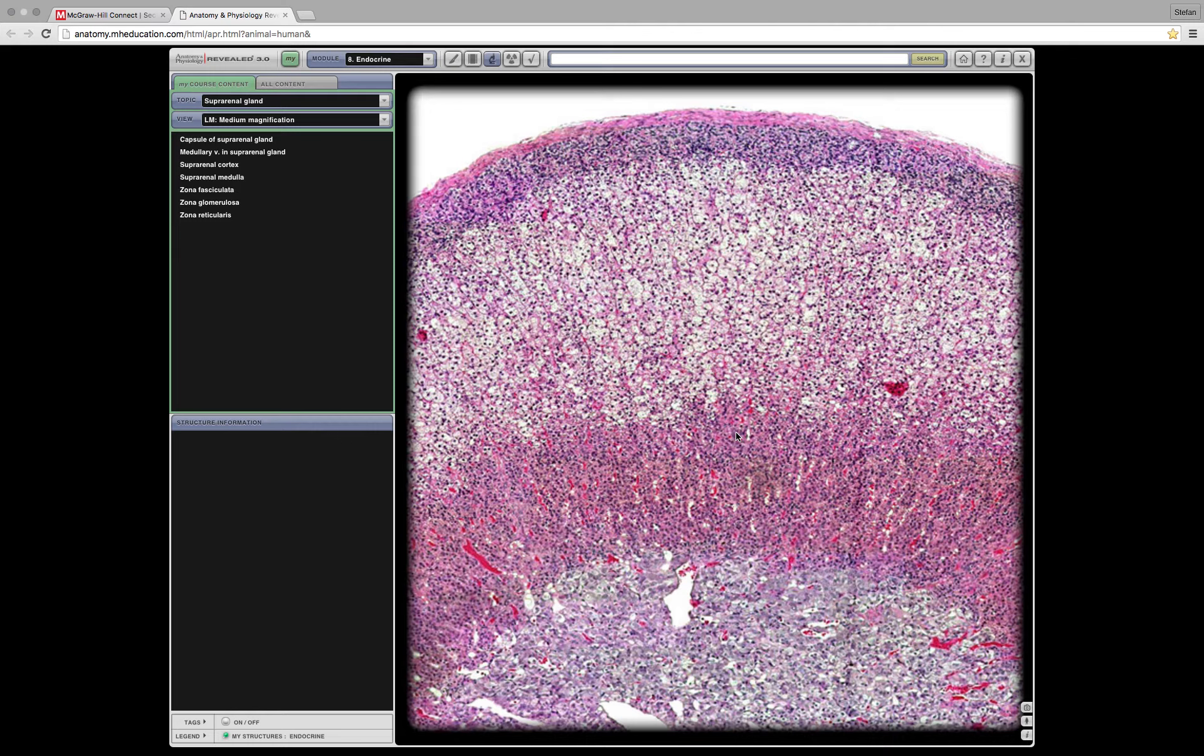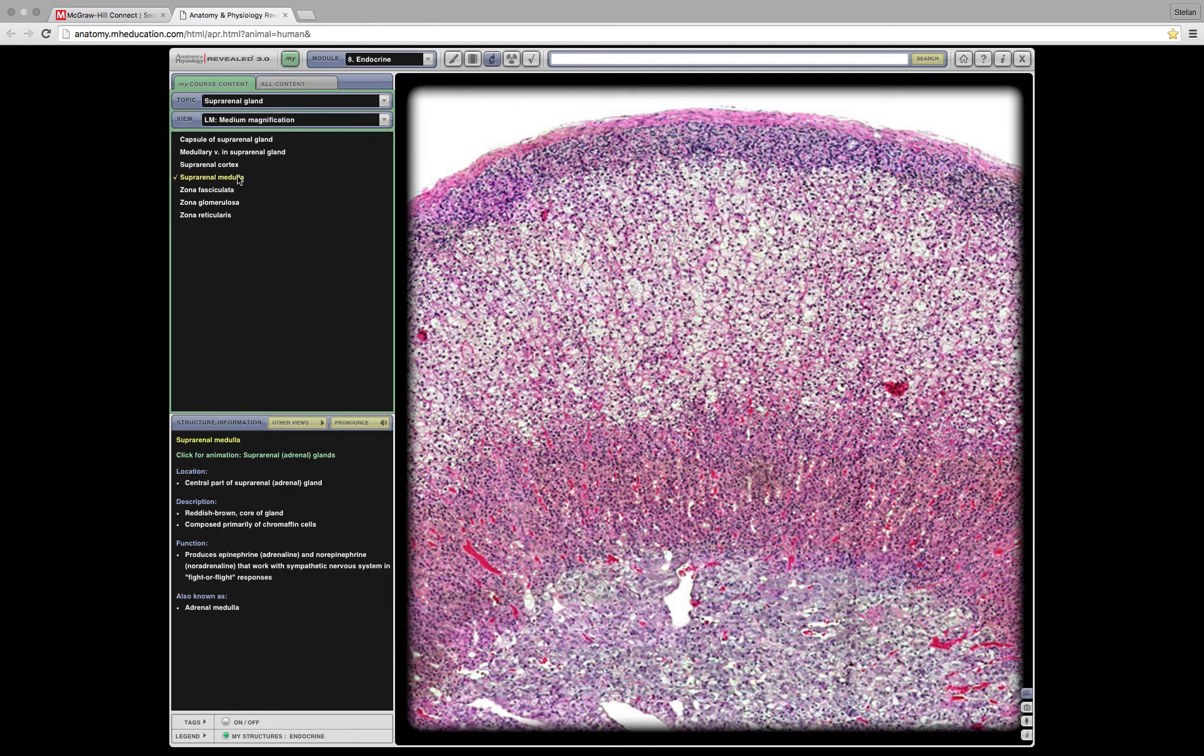As you can see, let me rephrase, you can clearly see separation. There's a medium rare layer, which is called the medulla, which is all the way in the middle, medulla. Here we go.